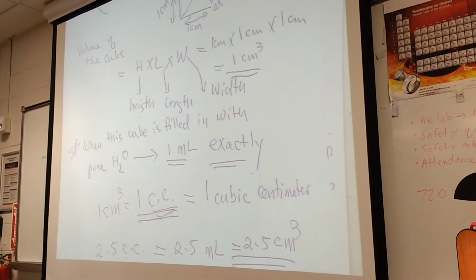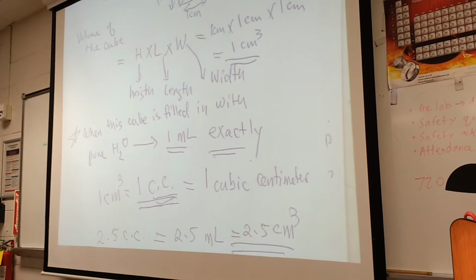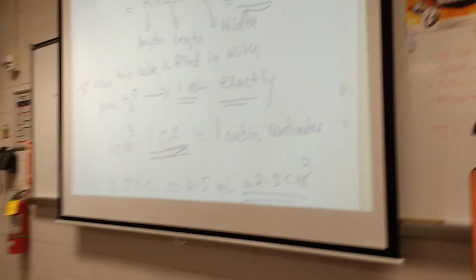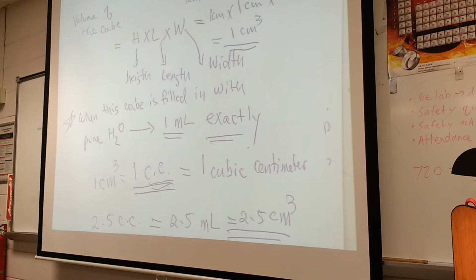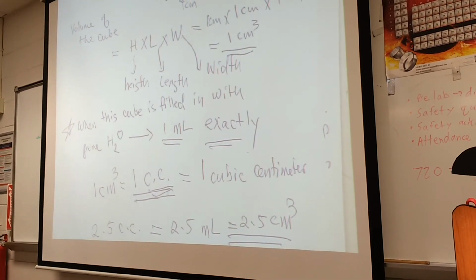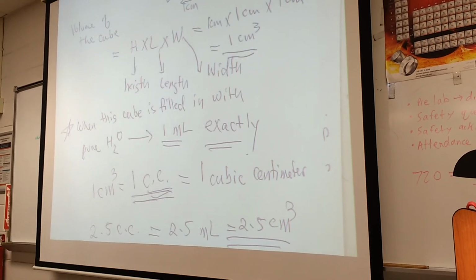You get the idea? Now sometimes we don't have in the lab the means to measure the cc exactly, or to measure 1 ml. A graduated cylinder, you can see, is very hard. Barely can you measure 1 ml with the graduated cylinder. The only thing you have to use is pipettes or burettes. But you need quick, rough and crude measurements.